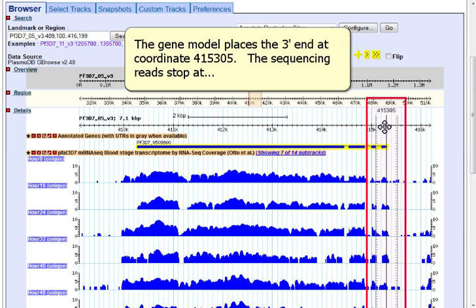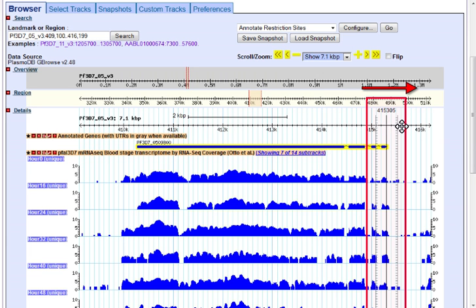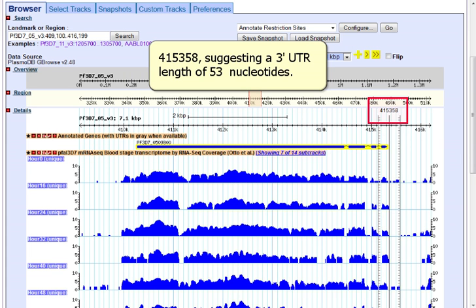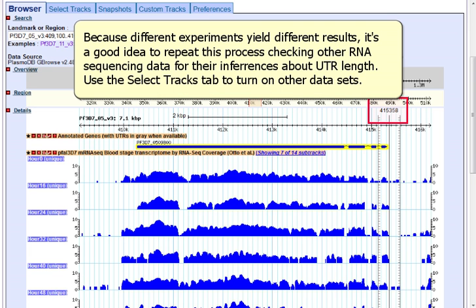The sequencing reads stop at 415,358, suggesting a 3' UTR length of 53 nucleotides.